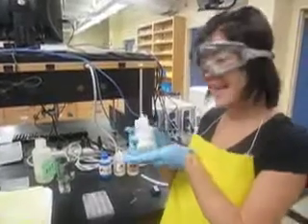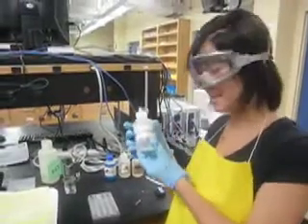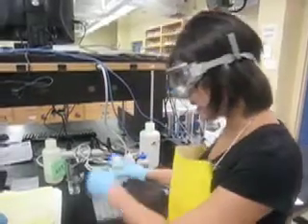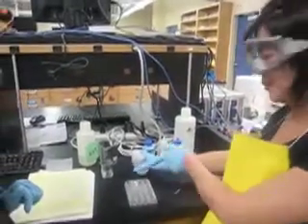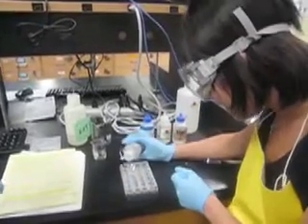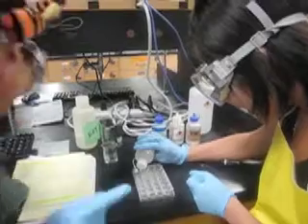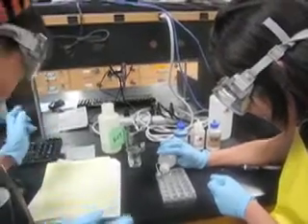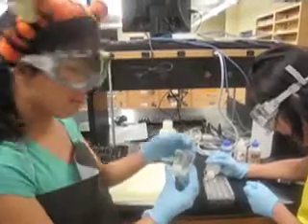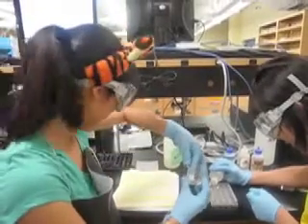Let's prepare our cell by putting 25 drops of sulfate solution into each of these spot plate holes with their corresponding electrodes. Remember though, in order to keep the battery running, make sure to add a salt bridge. The salt bridge is a strip of filter paper placed in KCl solution.